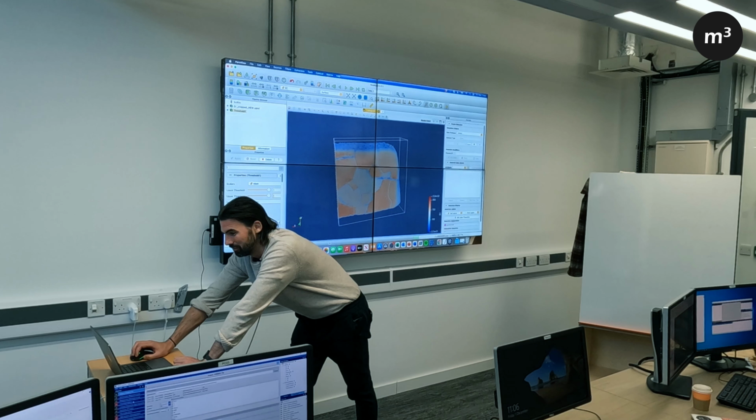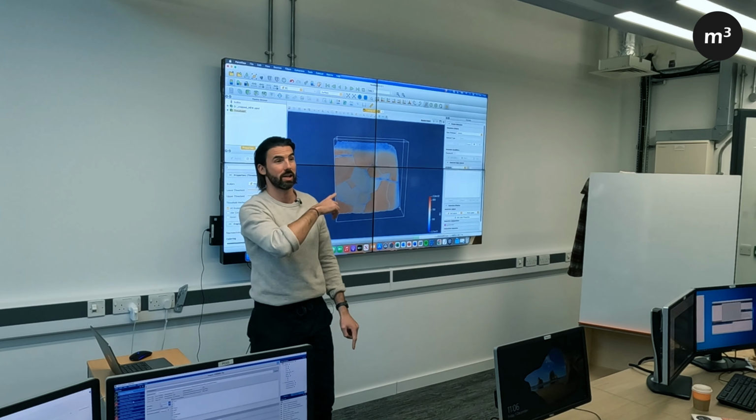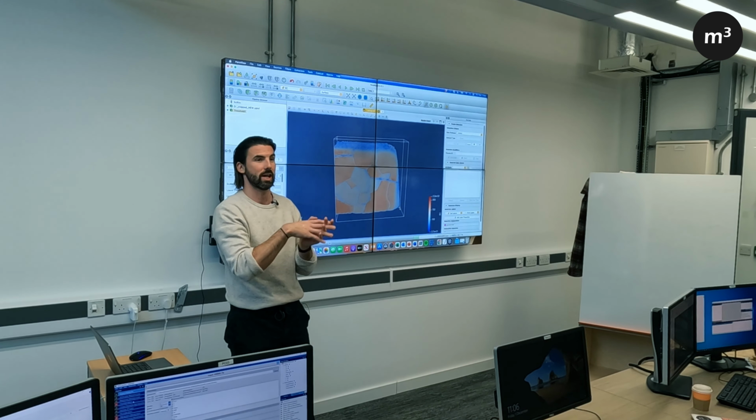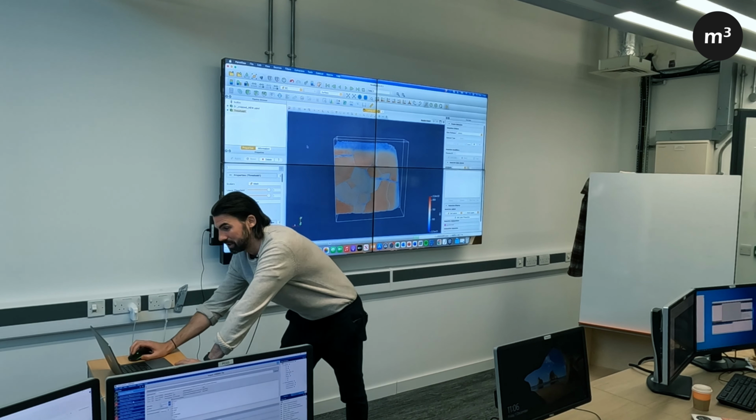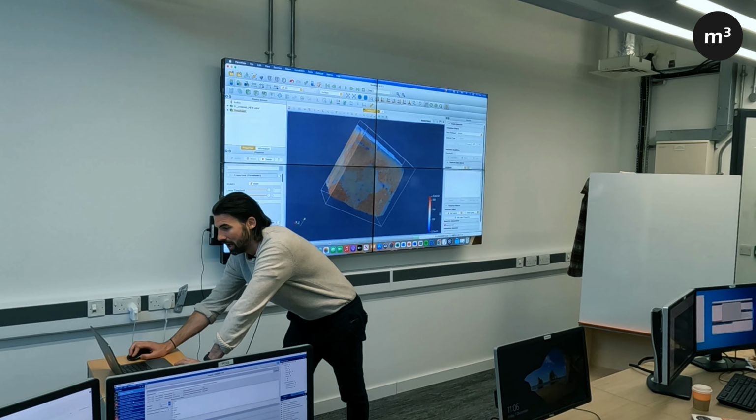Right, brilliant. So this is a cropped version of the zirconium dataset I showed you earlier. Again, we just cropped this yesterday just so it's easier to work with today. But this is part of a larger dataset. You can see where it's been cropped off there. So that's basically our mask. This shows us all of our index points.